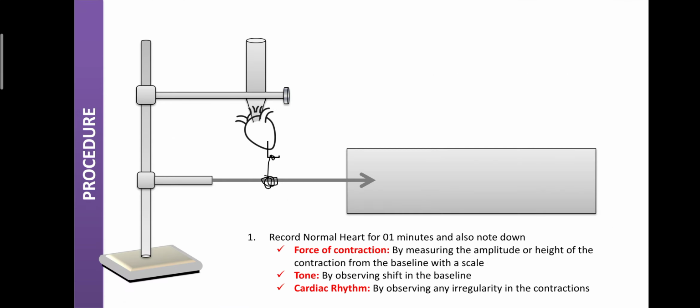Now we learn the procedure to study the effect of cardiac stimulant and cardiac depressant drugs on an isolated frog heart.